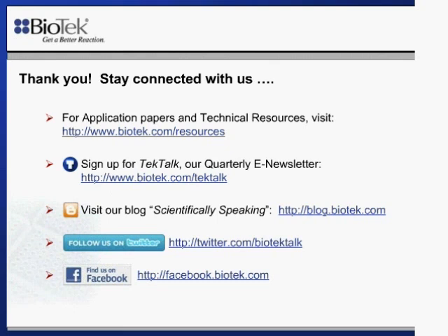It looks like I have time for maybe one more question here. Let's see. Is it possible to use one calibration curve for quantifying the amount of cells on different days? Yes, you should be able to use a calibration curve. The optical density at 600 should not change for that particular culture unless you're changing the media that the cells are in. Then you might get a slightly different value. However, as long as you're continuing the same culturing process, once you have your calibration curve, you should be able to use that from day to day.